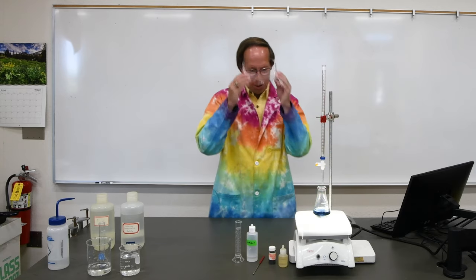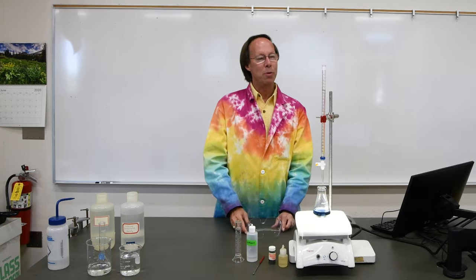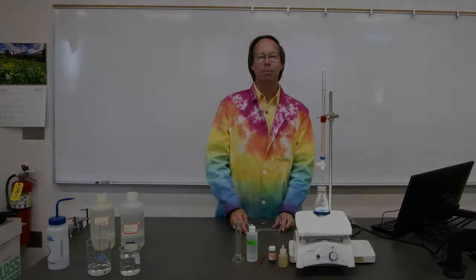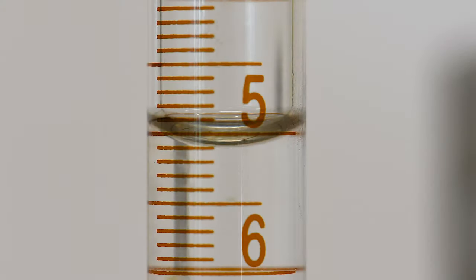So let's go ahead and take a final reading of the burette, and that will be all the data you'll need for the experiment. Here's the final burette reading for our last trial. You have all the data you need now to go ahead and calculate the water hardness for each of the samples and answer the questions at the end of the lab.